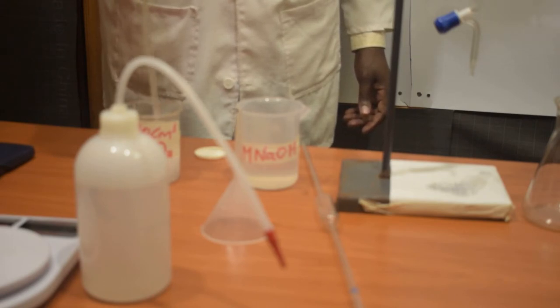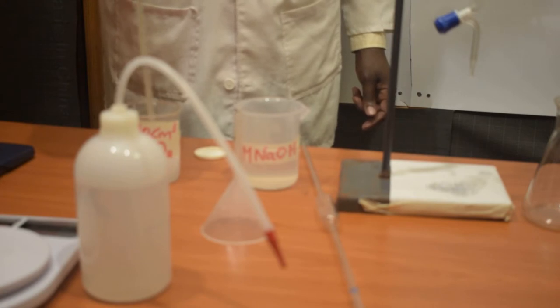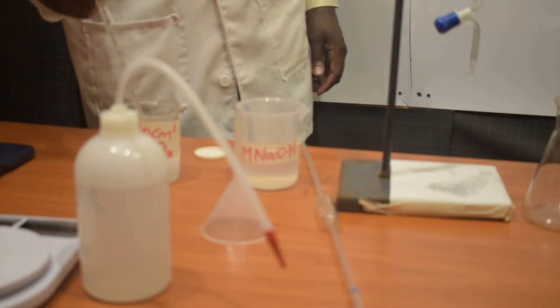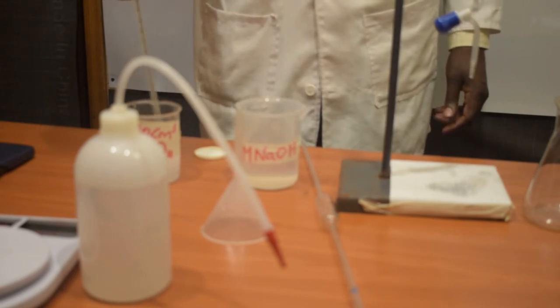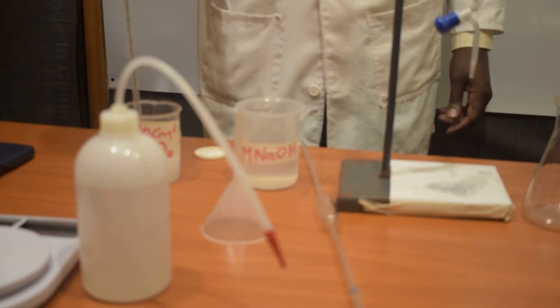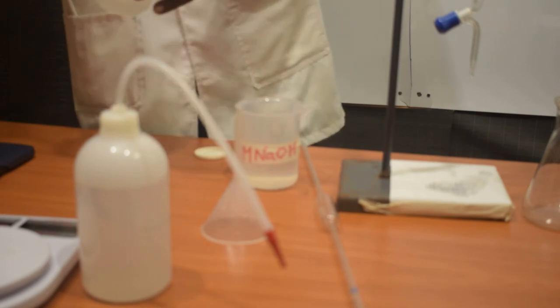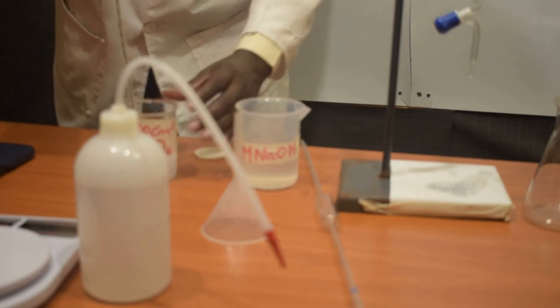So the reaction of a carbonate with an acid forms a salt. In this case, it will be sodium sulfate plus water. And of course, we have seen the effervescence, which happens due to production of carbon dioxide. That's what we're talking about.